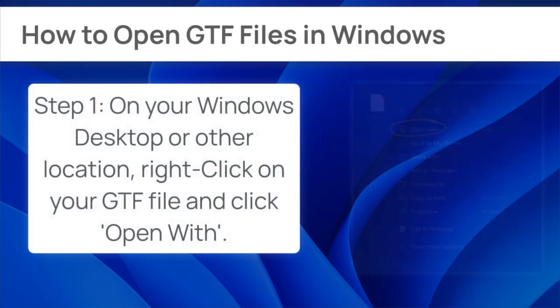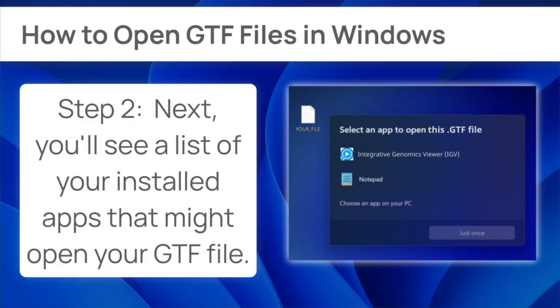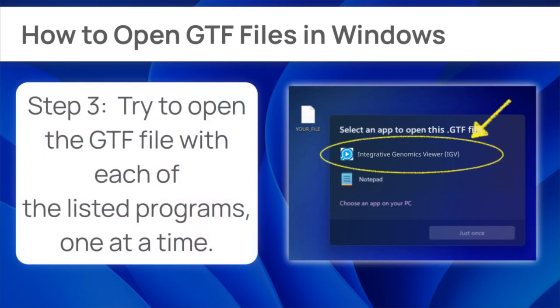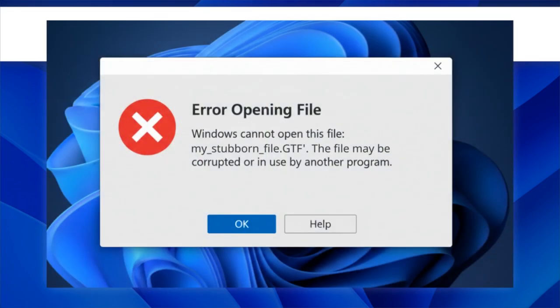The problem is often a missing file hook. Right-click the GTF file and choose Open With. Start with Integrative Genomics Viewer, IGV, if available. If not, select another application from the list. When your GTF file does not open, it is usually a small issue.